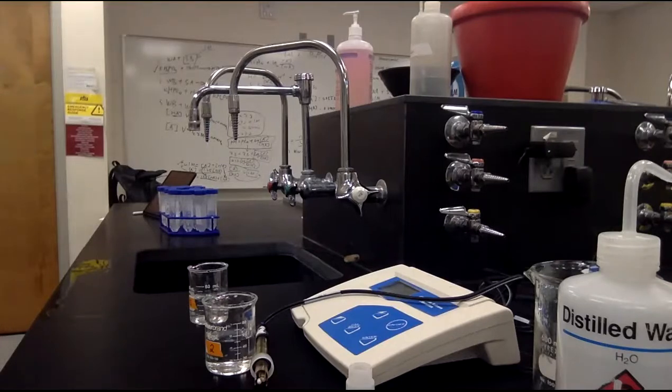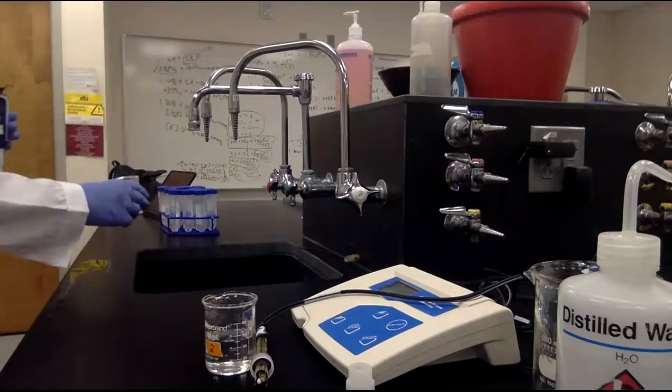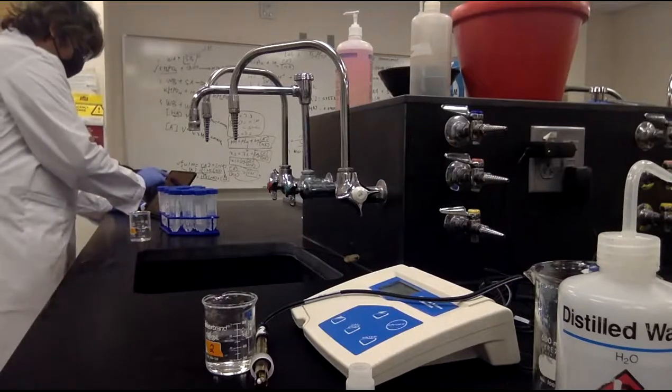So it's real quick. This guy measures up to 1,000, right? Yes. So this part, if I do 500, that would be okay. All right. So I'm gonna put acid in 1. I'm just gonna write the data down first.